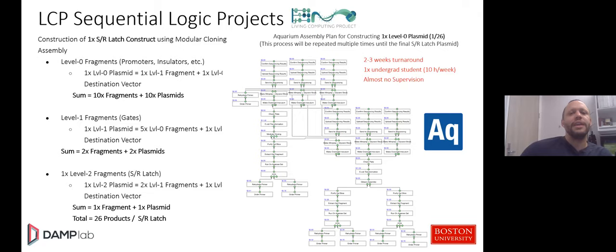that we've developed. And so what we have on the right is the Aquarium protocol that's required to put some of these together. So just to put together one SR latch, what at first glance looks to be a relatively complex procedure. But we're able to do this, with what's shown on the right in red, in about 2 to 3 weeks, with about one undergrad student and really little supervision.